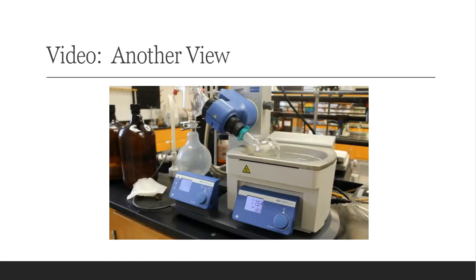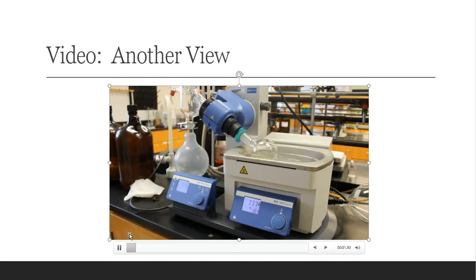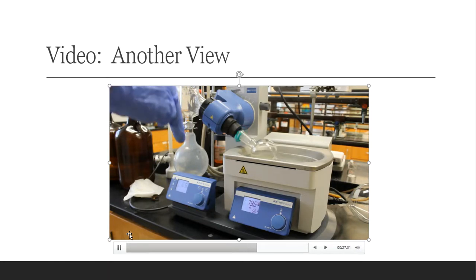All right, so here's another view of that process happening. Here I just wanted to give you a bigger view of how this machine is operating. I think that you can see everything in the image now. Over here to the right-hand side is my peanut oil and petroleum ether turning around in the hot water bath. My petroleum ether is getting heated up from that flask. The vapors are getting sent through into the reflux unit over here to the left, and then drip down into my receiving flask, which is there. Again, I have control of the temperature. I also have control of the speed of how fast that rotates.